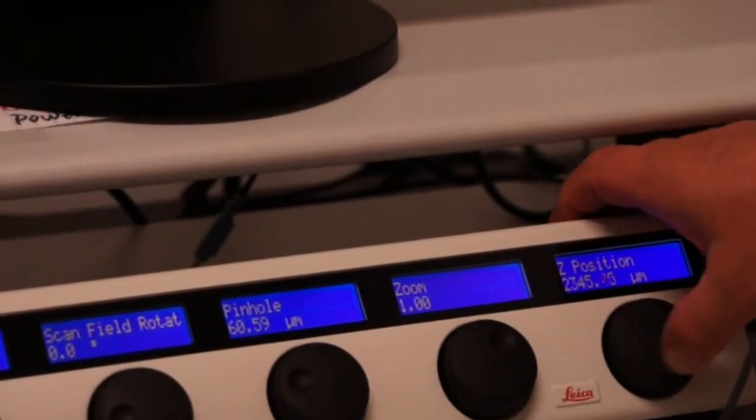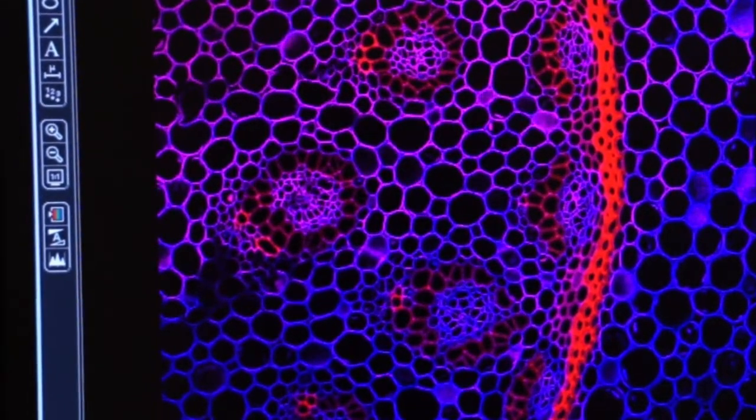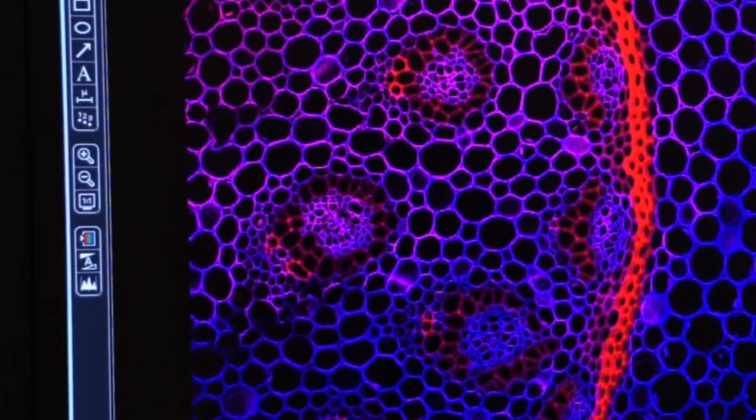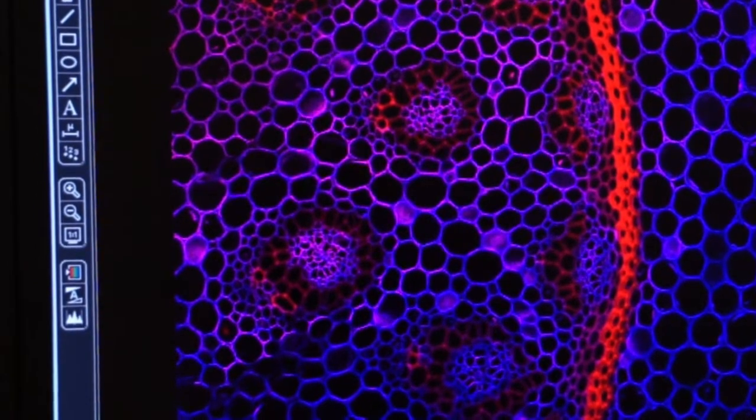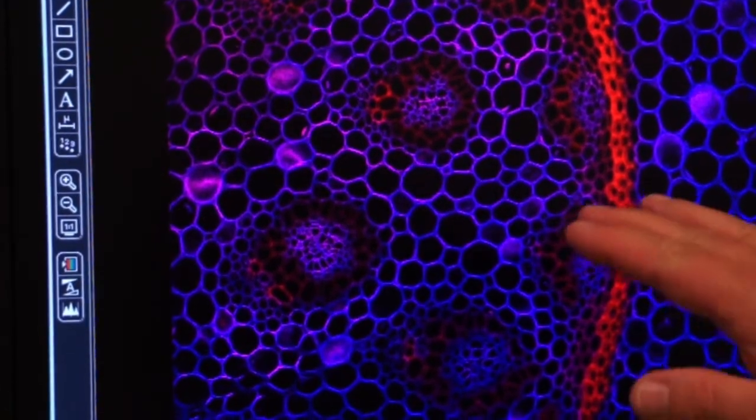And this may take a while. We just continue to turn this knob until we've come to the top of the image that we want to produce the ZStack. And you can see the focus improving, and we will go beyond the focus point to where it's defocused just a little bit. And we're going to tell the system that is my end point where I want you to finish the ZStack. So there we've selected now a portion at the above point of the focal plane.